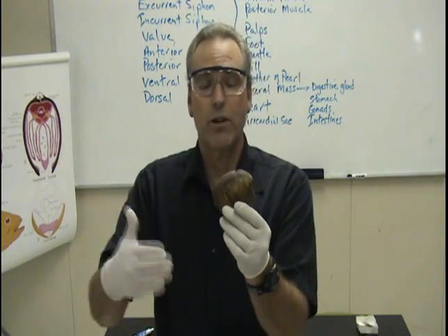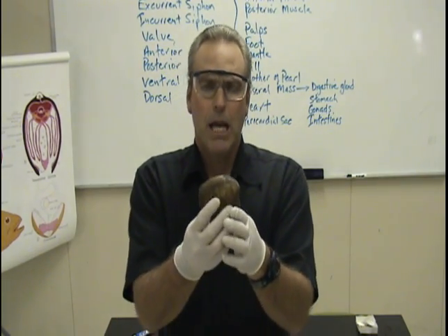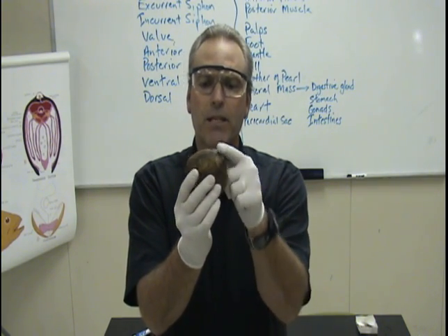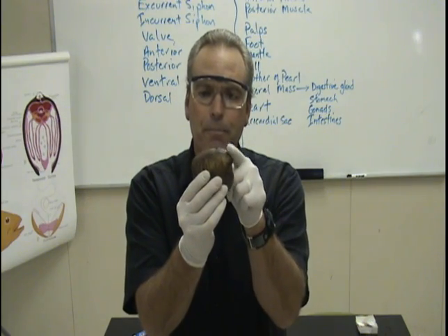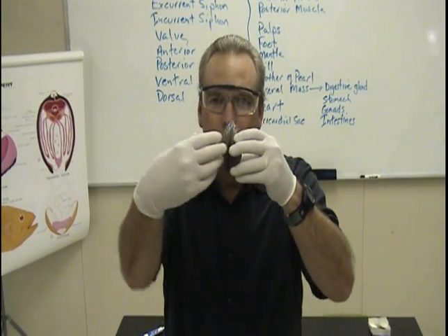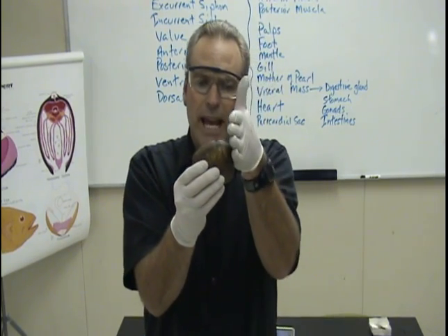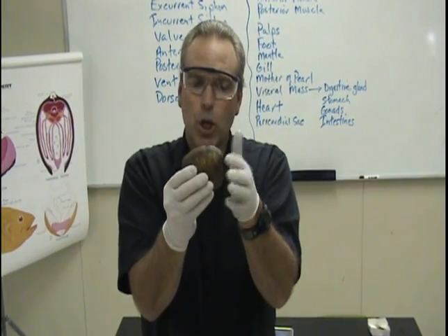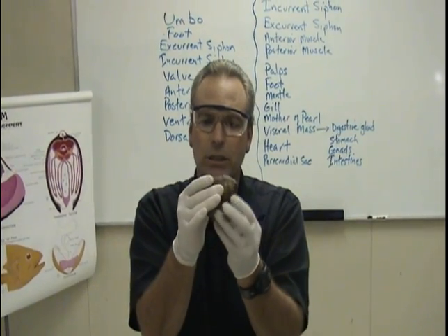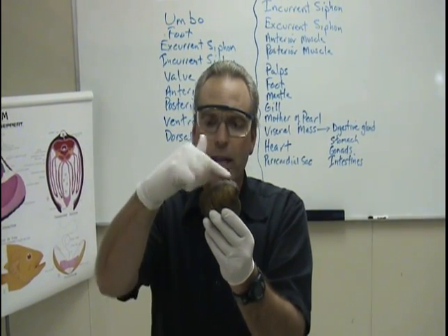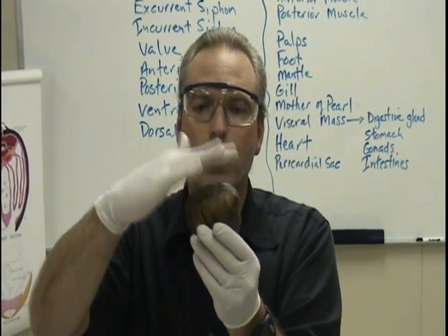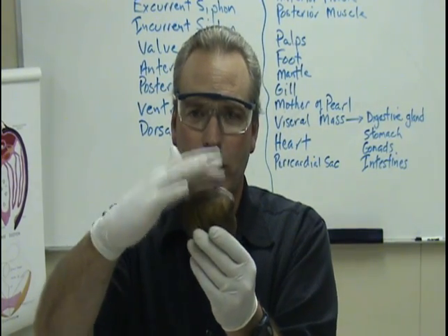Let's go over the anterior, posterior, dorsal, and ventral. The anterior side is where the umbo is — these little bumps right here are the umbo. Where they come together it's called a hinge; if we were to open this up it would hinge open. So here's the anterior end, closest to the umbo. The posterior end is the opposite side. The dorsal side is where the hinge is — dorsal hinge.